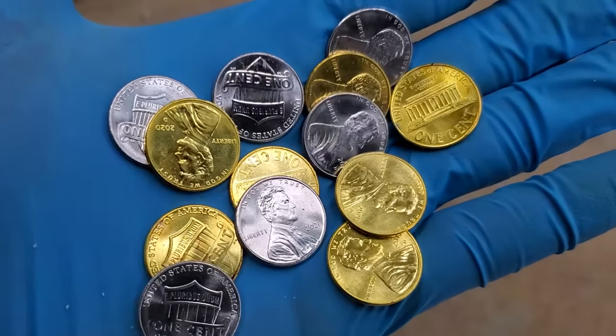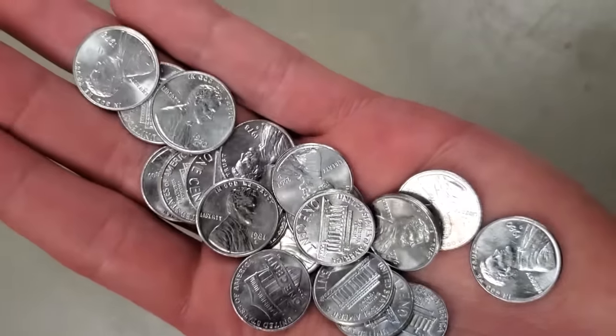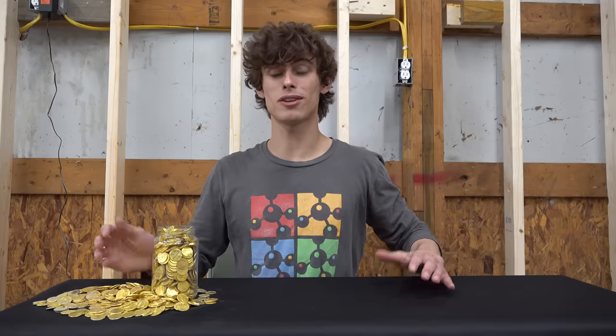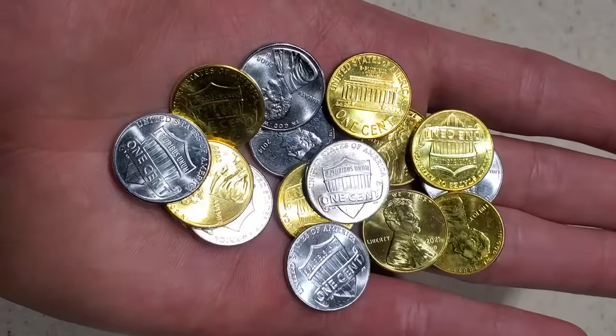Right here I have some pennies that I turned into silver and gold, and I did it using one of the coolest chemistry demos I know of. They aren't actually gold, but the experiment is magic in more ways than meet the eye. I don't think I've ever seen a chemistry demo that seems to just so blatantly violate the laws of physics. There are a few variations of this penny alchemy experiment, but they all give the same result.